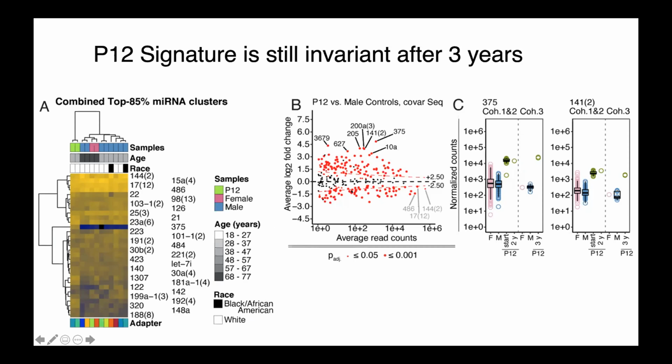Now, considering the different sequencing methods we had to apply as covariates, we can clearly say that this individual has this neuroendocrine signature defined by a 10-fold elevated contribution of microRNA 375. And several epithelial contributions involving cistron 200A3, 141, and 205, amongst other differences which are not as strong.